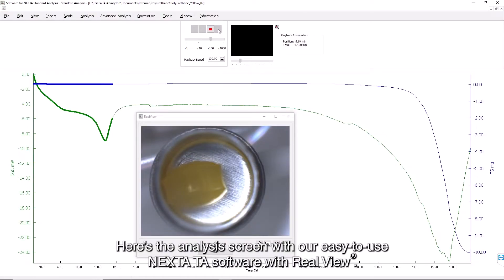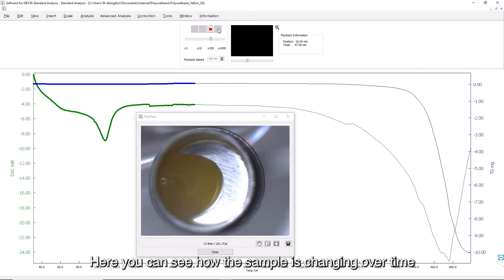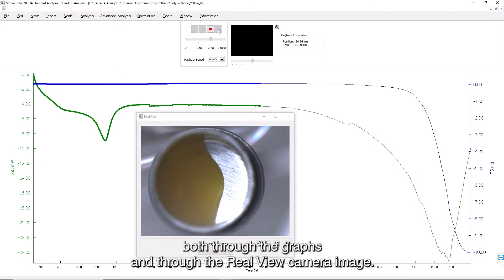Here's the analysis screen with our easy to use Nexter TA software with real view. Here you can see how the sample is changing over time, both through the graphs and through the real view camera image.